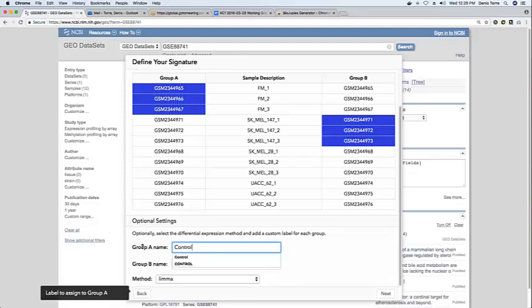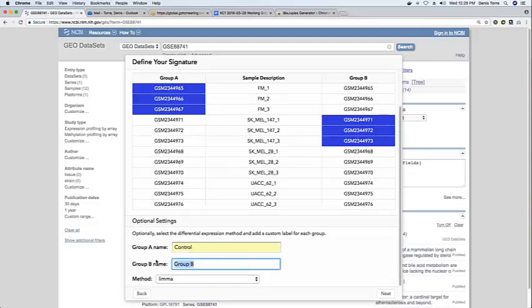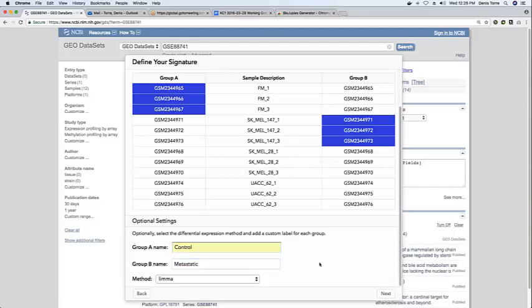And the user can also name the groups by using the interface below. So in this specific case, we'll compare control samples to metastatic samples.